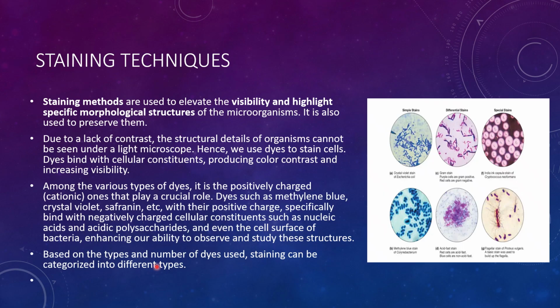Based on the types and number of dyes used, we can categorize them into different types of staining methods.